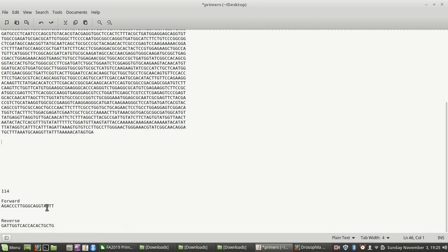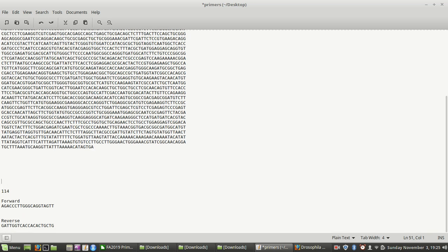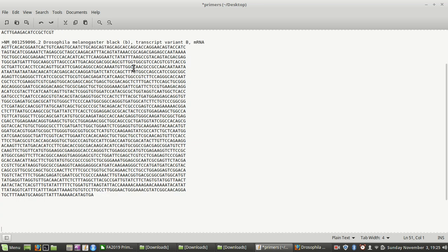Now then, we would do the same thing here with 114 and find the sequence associated with those. I'm going to end this part of the tutorial here. Just understand that this particular sequence needs to be compared to the Finch TV results.